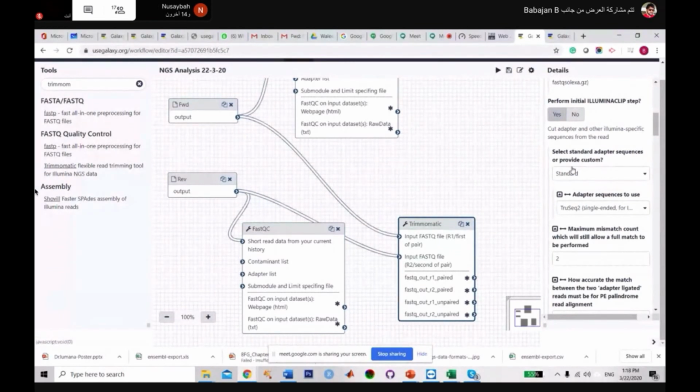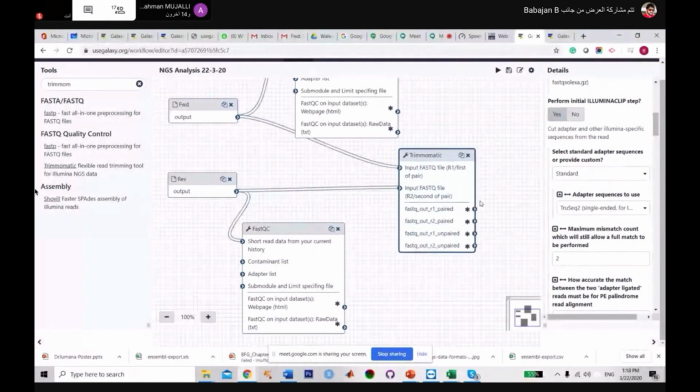Generally, as I told you, Trimmomatic is not always useful for you, because nowadays Illumina is giving high quality sequences for us. If you get the Phred quality more than 20, you need not use this one. You can directly go to the alignment tool. Once you get the report from FastQC, check that. If the quality score is more than 20, you can directly go to the alignment step. If the quality is not good, then only you have to use these Trimmomatic approaches.